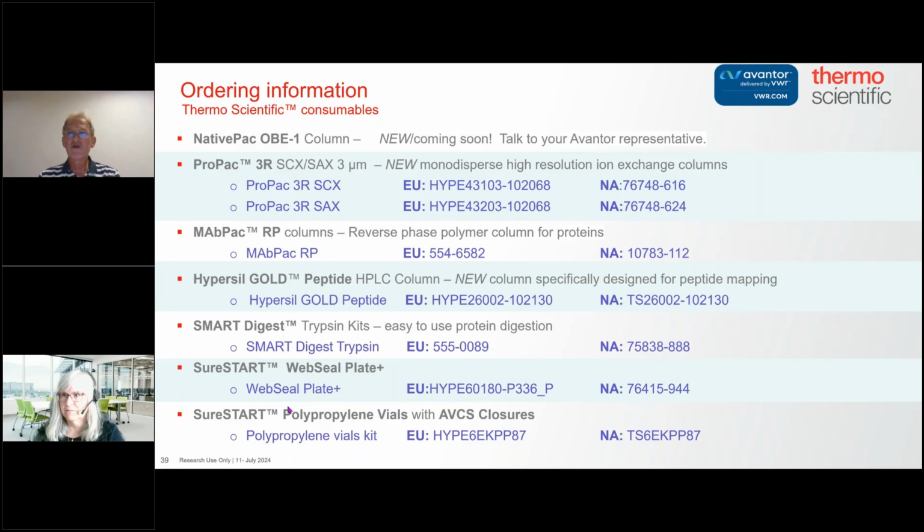With polydisperse, if you've got slightly bigger particles, it packs slightly differently, and you can get a different capacity. And capacity means a lot when it comes to chromatography. For small molecules it doesn't matter so much, but with proteins, and oligonucleotides are the same, they tend to elute in a much narrower organic solvent window.